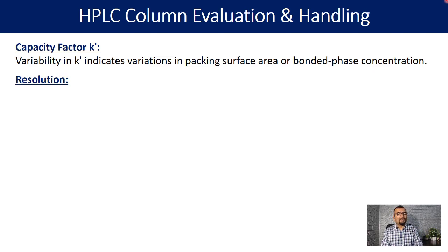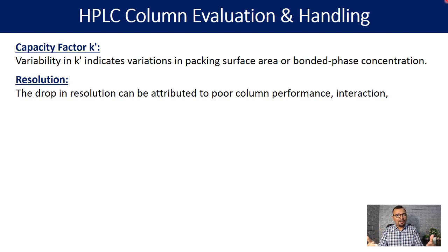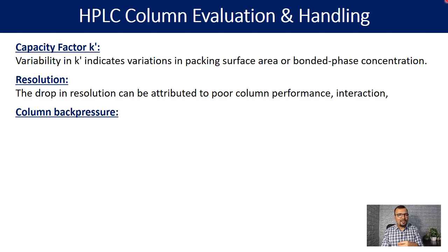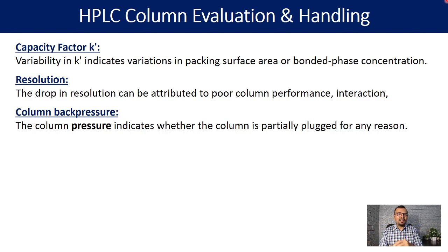Resolution is one of the very key aspects of chromatographic separation. A drop in resolution can be attributed to poor column performance or lower interaction, and this is a key reason why you often have to change the column. Column back pressure always limits usage beyond a certain pressure. The column pressure indicates whether the column is partially plugged — especially when using mobile phases containing buffers — and if there is microbial growth on the frit or inside the stationary phase, column back pressure can certainly get high.